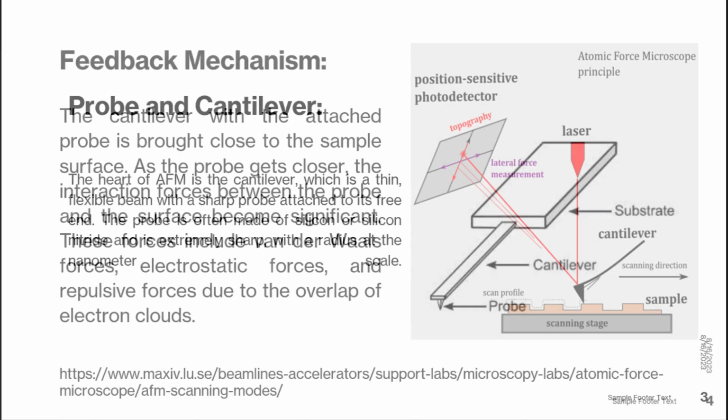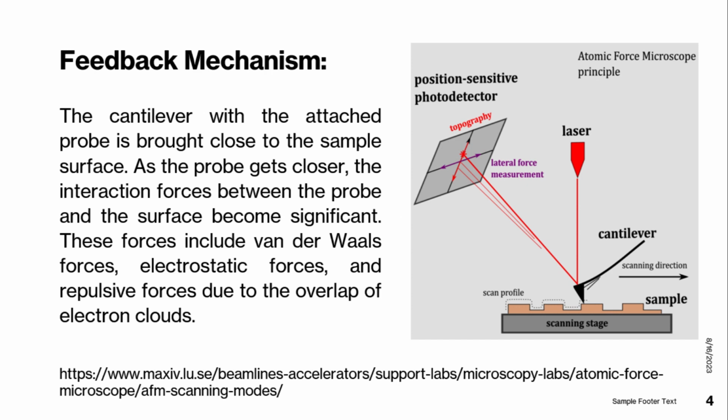Feedback mechanism. The cantilever with the attached probe is brought close to the sample surface. As the probe gets closer, the interaction forces between the probe and the surface become significant. These forces include van der Waals forces, electrostatic forces, and repulsive forces due to the overlap of electron clouds.